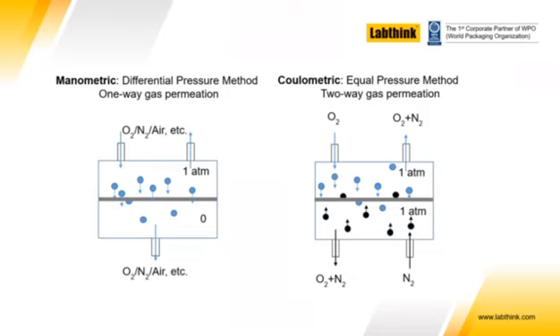And so through the specimen, as the molecules are diffusing and moving around inside the specimen, you have nitrogen molecules mixing with oxygen molecules. And so there is a capacity for some interference to occur at that point where you have the molecules mixed together.